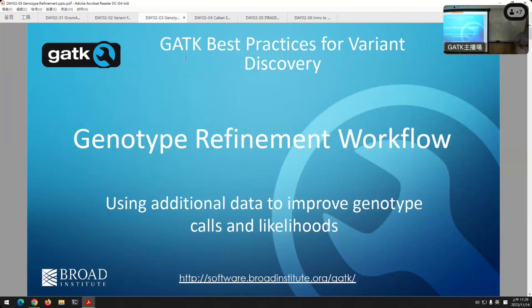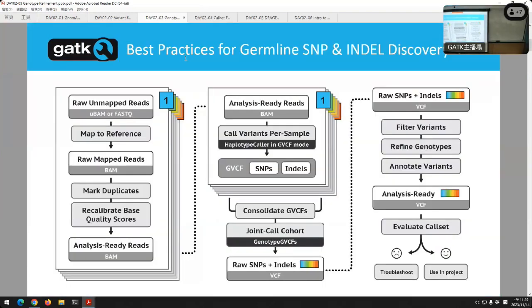For the most part, the problem is with the likelihoods and not with this case. But we saw this case enough. Obviously, it causes a Mendelian violation, so that's the first thing we look at for large deletions. But for the most part, when you see a Mendelian violation, it's not an issue with variant calling, but with the technologies. I'll show you some examples of where things are very strange inside the reads, the sequencing data itself.